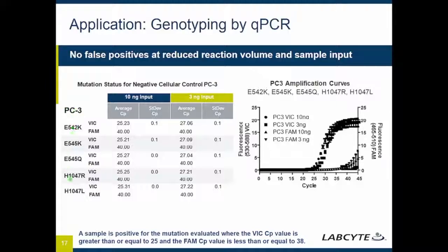And these primer sets here are going to detect mutations present. And clearly there's no detection of any of the mutations in the DNA sample tested. There's a nice Vic signal, but there's really no FAM, which would indicate the positive nature of the sample for the mutation tested.